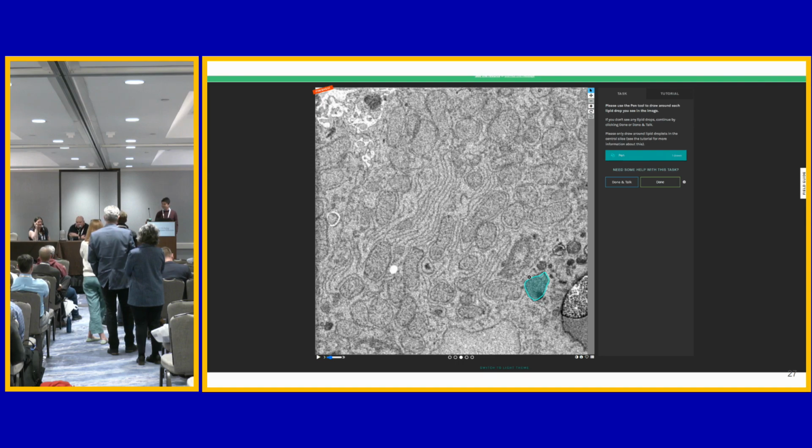Yeah, that was a good segue. I was going to follow up on something else Kevin said, but it's perfect for this as well. With something like CellPose, you can start with what's called human in the loop, and you can say, here's how good it starts, and then you can iteratively show that it's improving very quickly. All of these retraining approaches, like Thomas mentioned, and these human-in-the-loop approaches, have much less computational requirement. And if you can find something that somebody already did, it's often even lower. Like the tool that I showed, we've tested on Kindle Fire tablets and smartphones and it works.